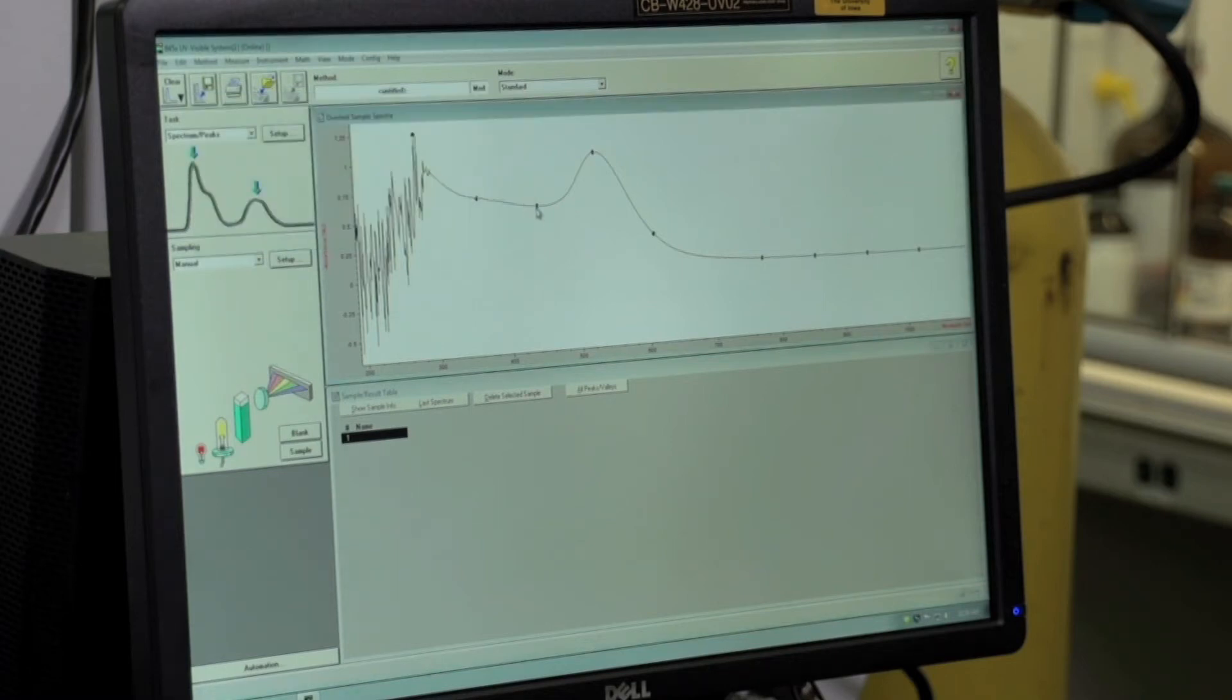After you've saved your file, you'll need to delete the spectrum that's present so that you can take another sample. So just make sure it's still highlighted and click on delete selected sample.